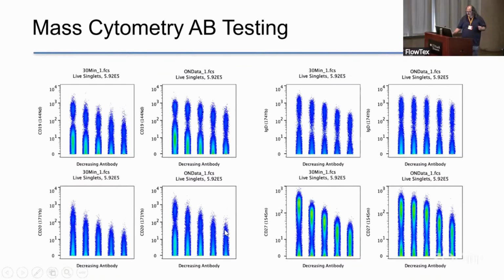Not popping out. Oh yeah, here's one. This one actually was higher for signal using just the standard 30 minutes as opposed to the overnight. So it's not like there's a set rule that overnight always improves your data. That's one of the things I worried about whenever I was reading the papers, that they kind of cherry picked certain markers and only showed certain ones, that entire thing.